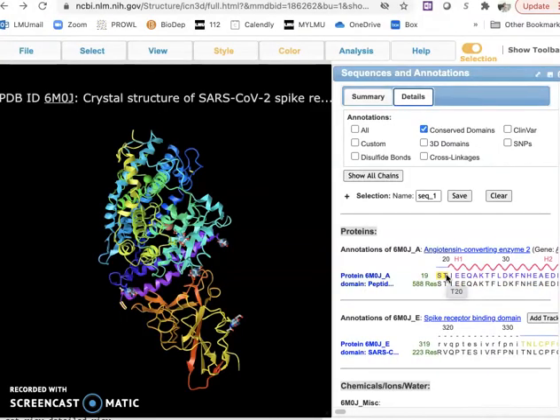So I highlighted the N-terminus of the AC2 receptor, and you could see it highlighted right here. You can now see that the N-terminus starts with a purple color.